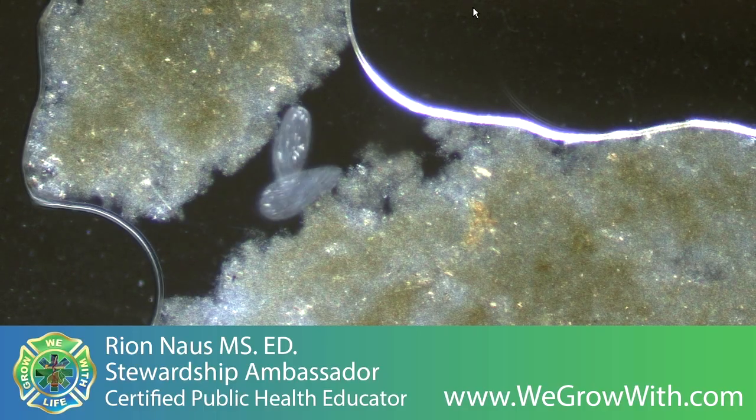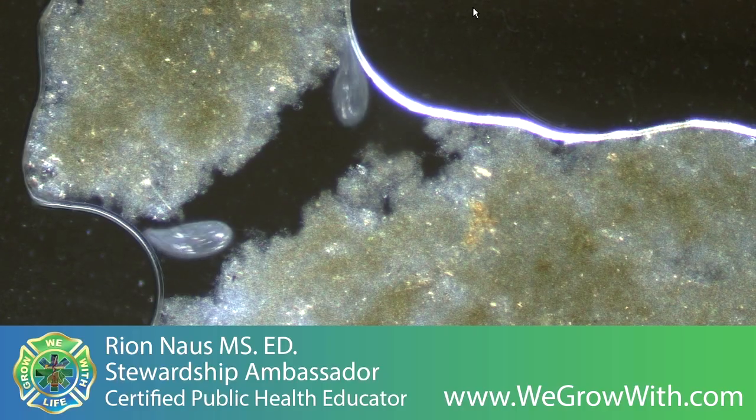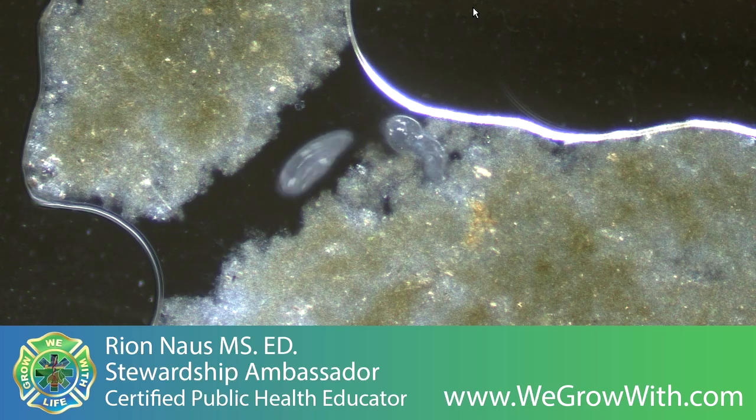I think Darkfield is pretty amazing for this. I think it creates a depth that Brightfield tends to wash out.